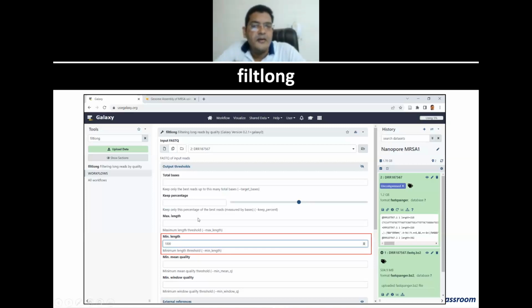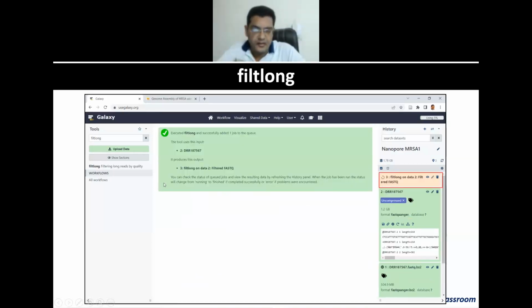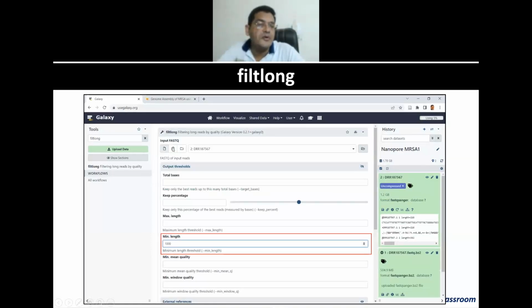We can upload likewise, we can do that. Then in that case, you'll have to click on this option where you'll upload 2 files, right? Okay. And so I'm on PowerPoint, so you'll click here, upload 2 files. Here one will be forward, the other will be reverse, right?